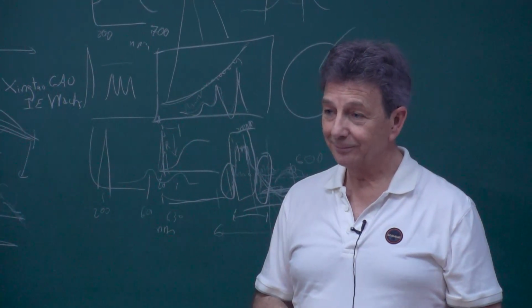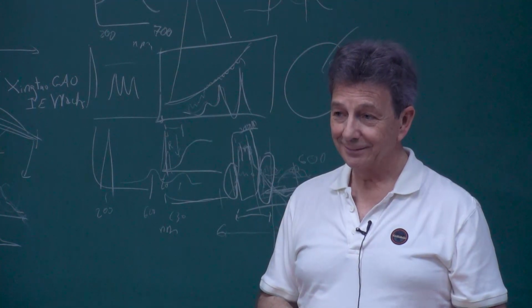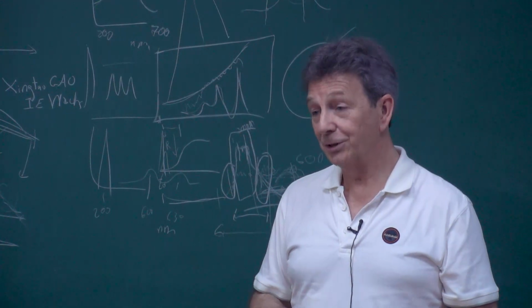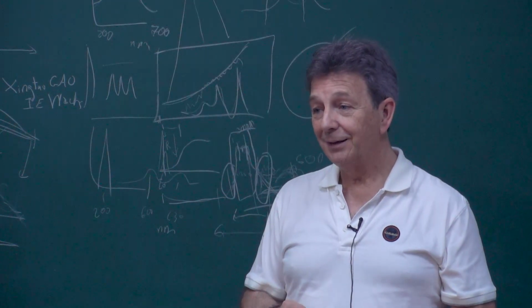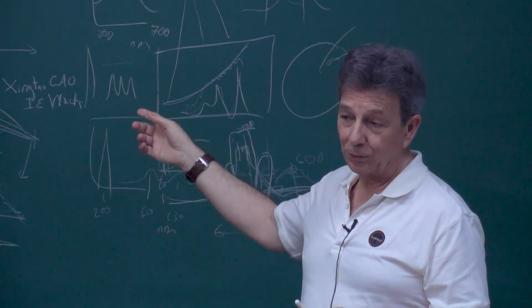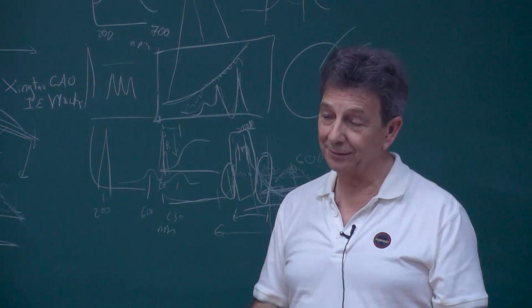There is another question from Suraj. He's asking, can we use the Kubelka-Munk function in DRIFTS for quantification? It's more quantitative than the other one. It's not absolutely quantitative, it assumes many things, but if you want to be quantitative, you have to go to transmission for infrared or for Raman, for infrared or for UV-Vis. Kubelka-Munk is the best approach you can do with all these scattering radiations.